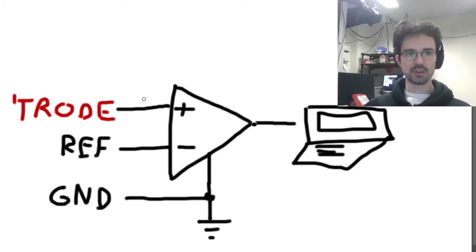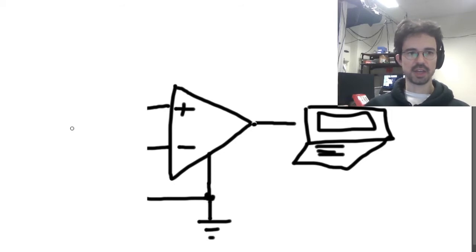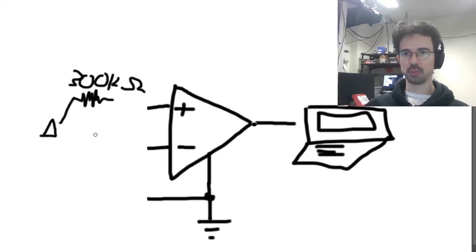So what this means is you have an extremely high input impedance here and here, and you have an extremely low one down here. If we have a weak signal from a tetrode or something like that, which we can conceptualize as having a very high output impedance, then we can still record from that just fine because we are not dropping any voltage across this resistor, because there is no current flowing in and out of here.